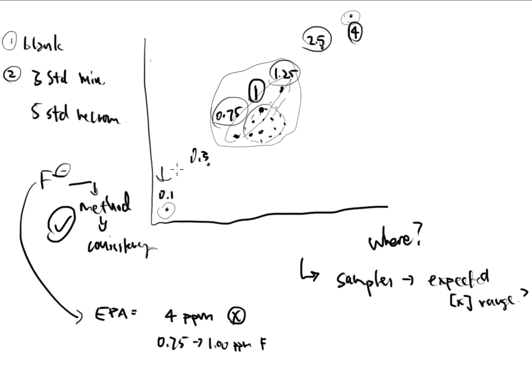So this is the whole concept of generating a calibration curve that is proper for your particular method that you're doing in a laboratory. So make sure that you have a span of standards, meaning make sure that you go really low and high, at least on the fringes. But then make sure that the majority of the standards that are important are revolving around your expected concentrations of your samples. And you'll get much better data, you'll look much better as a lab analyst, and that raise might come a little bit quicker for you.